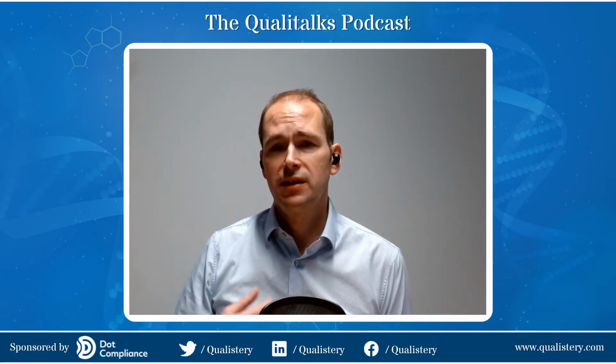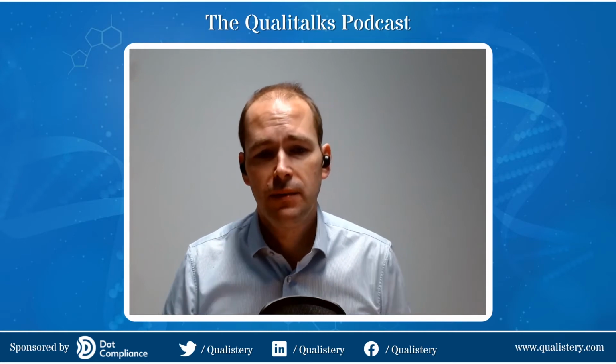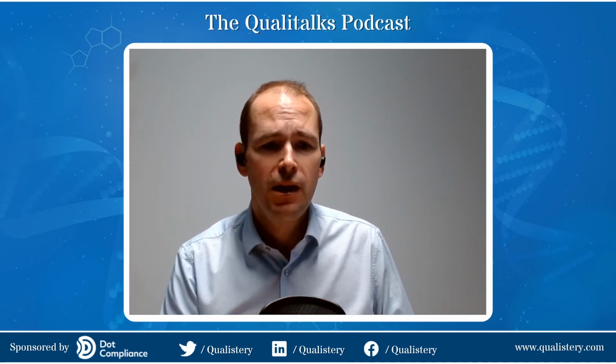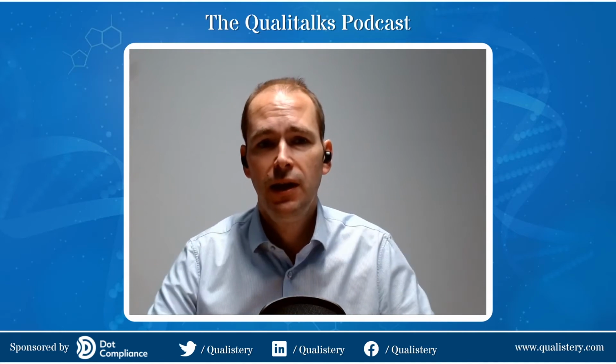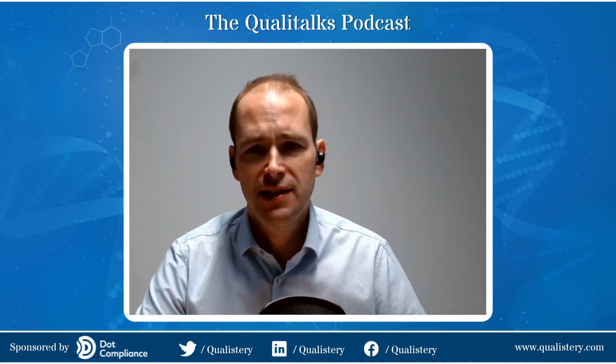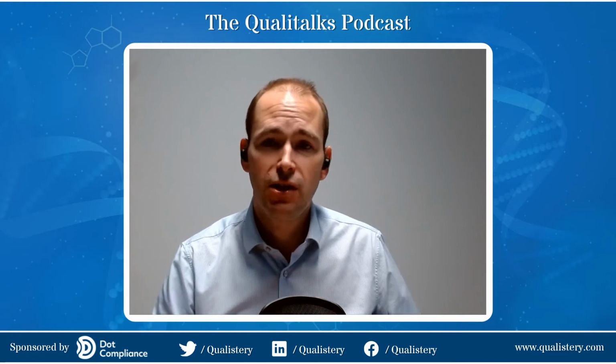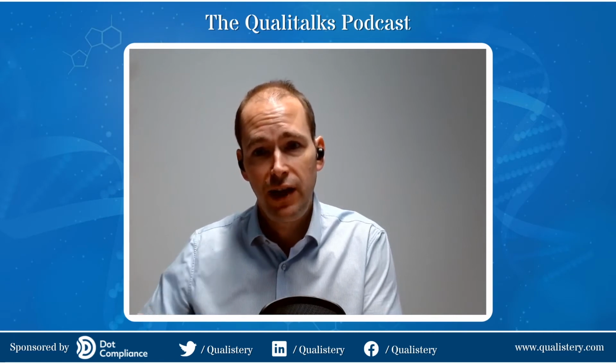And during that phase, we'll look at things like the alarms. We'll look at the different aspects of how the machine functions, the cycles that are already installed. We'll test them. And we might do some additional work to test air removal. So are the cycles robust enough for the loads that we anticipate using? So we use tests that are detailed in EN 285 for that, because they challenge the autoclave cycles rigorously. So assuming we can meet that criteria, we're at a good position and a good baseline to develop the autoclave cycles for the production loads.